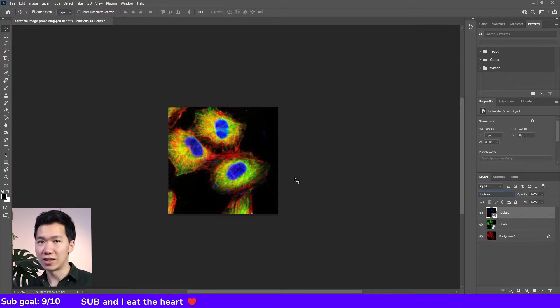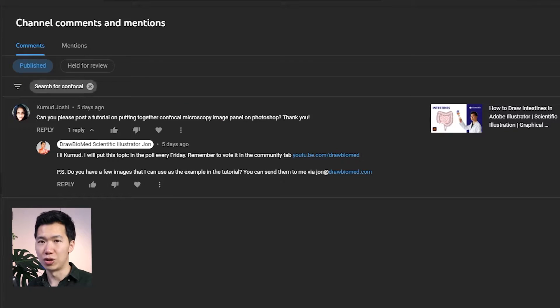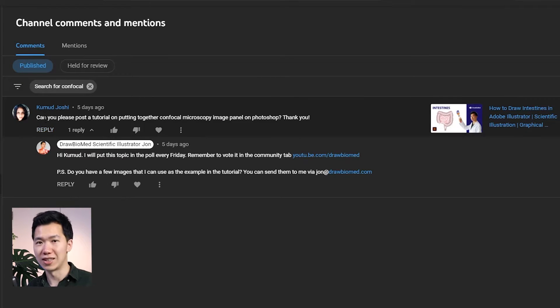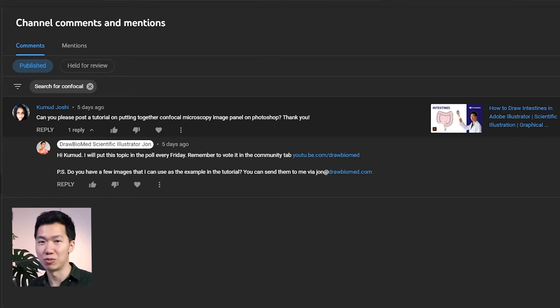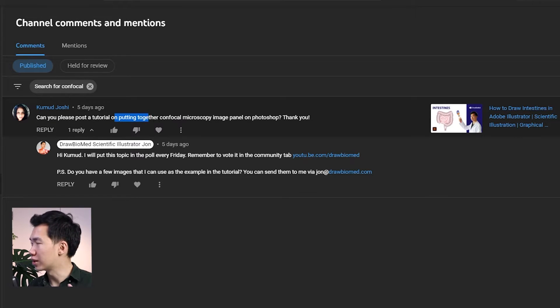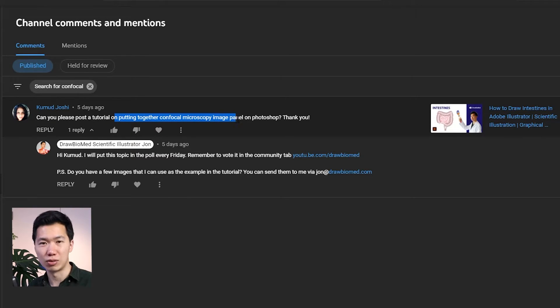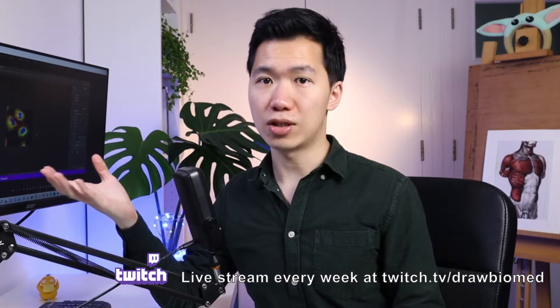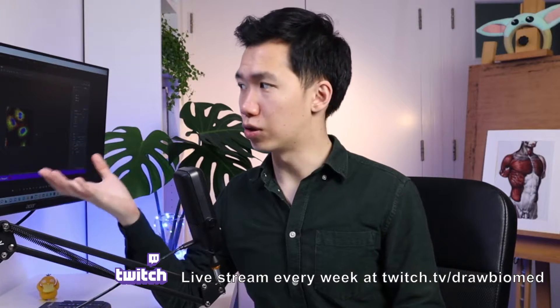The scientists were asked this topic — only about how to process confocal images in Photoshop — so I wasn't really sure what kind of processing she was referring to. I also demonstrated other tricks during the Twitch livestream.